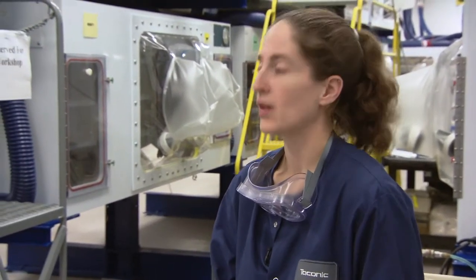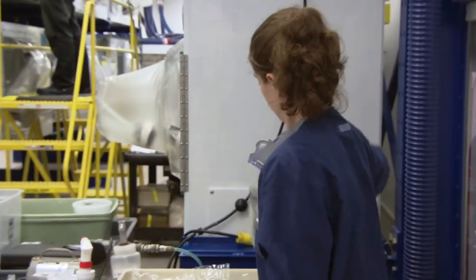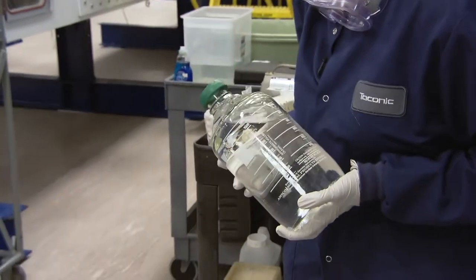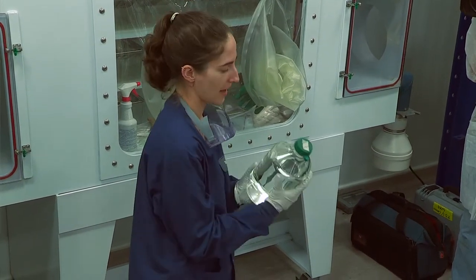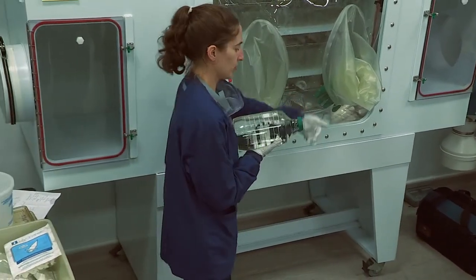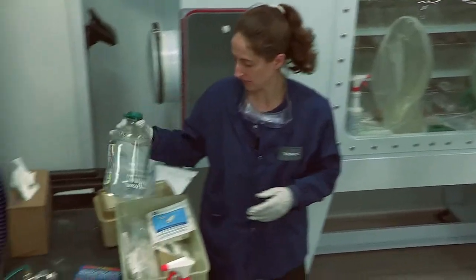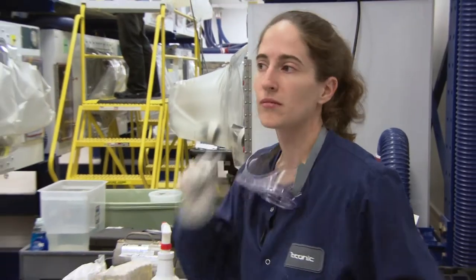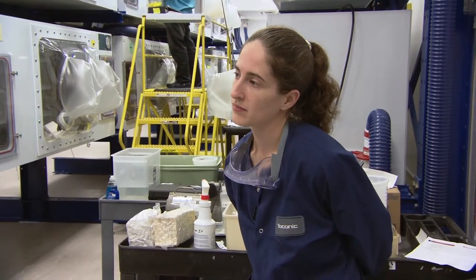I was over at Germantown and I think they were using water there to do the wipe out. In Germantown, they use water from the water flasks? I think — is it just that you leave the water there and then they're pouring some out to wipe it out? They would have extra French packs of water in the isolator, and they could wet some on a paper towel and use that to clean out the cages. Has anyone looked at the comparison of the health of the animals versus high or more frequent exposure to the aerosolized chemical Sterlents versus just the water?